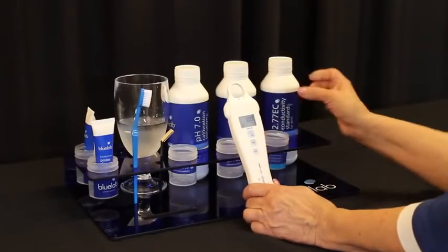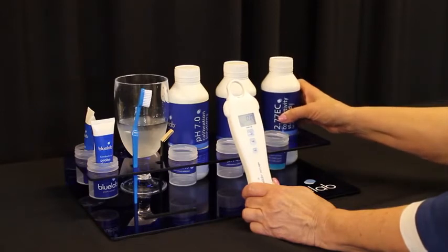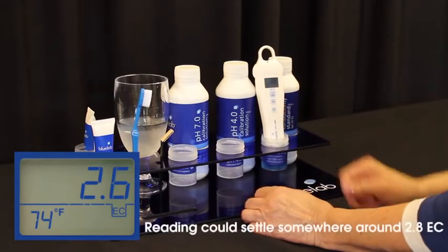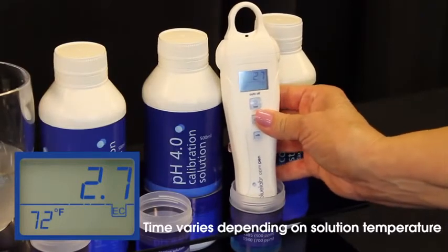Calibrating your PPM Pen: only use Bluelab calibration solution to make sure that your pen is calibrated correctly. Set your pen to EC. Place your pen in Bluelab 2.77 calibration solution and wait until the reading stops moving. This may take a minute or two.